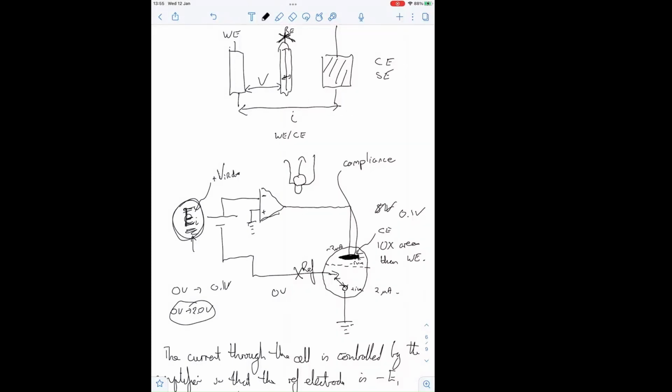So on potentiostats which don't have such a display, we always do an open circuit measurement at the start of every experiment, just to, A, see that there's a connection, and B, to check that problem that you described before with the reference, with the equilibration taking a while.